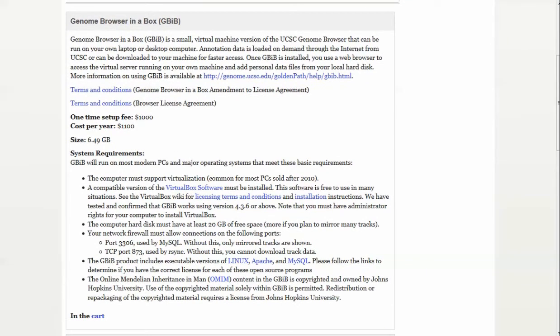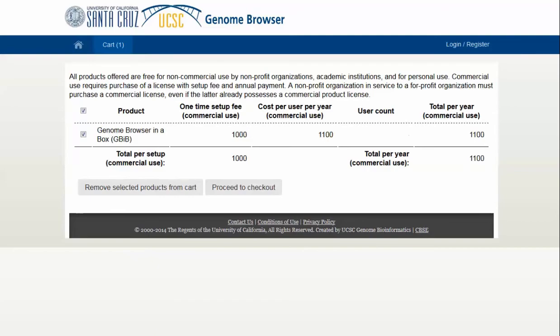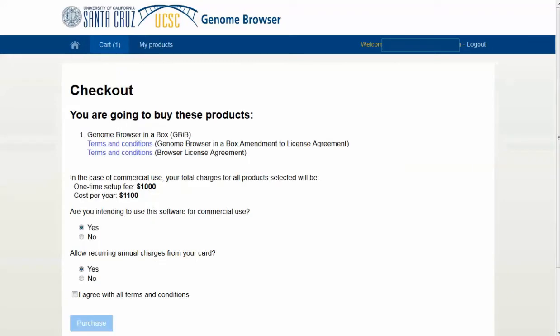I have a kind of an old computer and I was able to run all this perfectly fine. You put it into your cart, and although it does have pricing, once you proceed to checkout you have to create a registration. You can indicate whether you are using it as a fee-based user or if you're not using it for commercial use, and then you can download it. You can read the terms and then start to download.